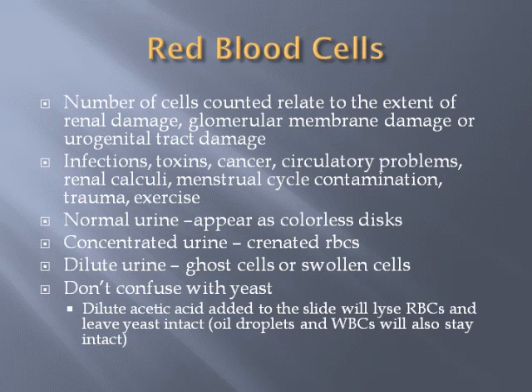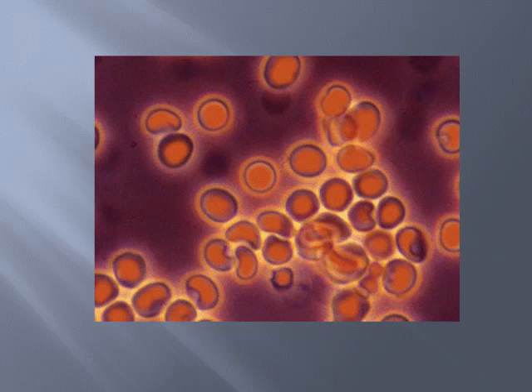It takes a lot of practice to get to know these cells, and when you're just starting out, the experience you gain in the student laboratory isn't even close to where you need to be for the real world, but hopefully you gained a lot of experience looking at cellular components in your practicum. This is just an image of red blood cells. Obviously, they look stained here, but there weren't very many great pictures of blood cells in urine. You really have to have the luxury of focusing when it comes to red blood cells in a urine sample.